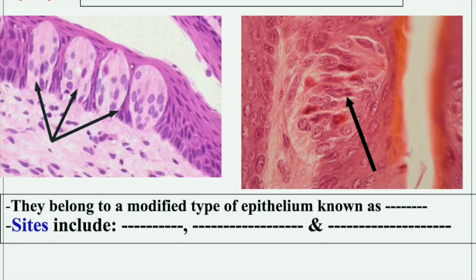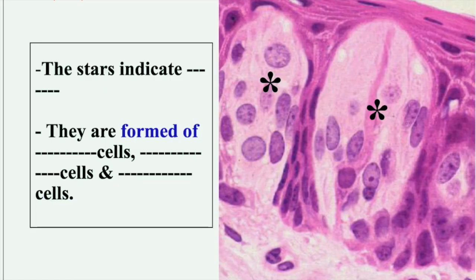The structures indicated are taste buds; they belong to a modified type of epithelium known as neuroepithelium. Their sites include four locations: tongue papillae, soft palate, epiglottis, and pharynx. The taste bud cells are identified by the shape and position of the nucleus: the basal cell is identified by its position; the gustatory cell by its more rounded and paler nucleus; and the supporting or sustentacular cell is characterized by the presence of a dark nucleus.